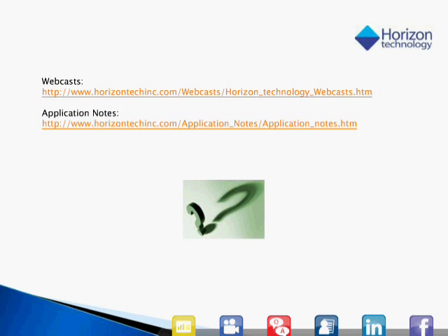All right. Next question. Does your mobile phase for SPE need to be liquid, or can you use SPE with gas as your mobile phase, akin to a GC line? You could use a gas, certainly. If you go back to the hygienic uses, those were carbon tubes, and you're pulling, in that case, a little vacuum pump on the back end, so you're pulling the room air in because you're looking at what volatiles are in a workspace. So, yes, it would certainly work, again, based on what analytes you're looking for.